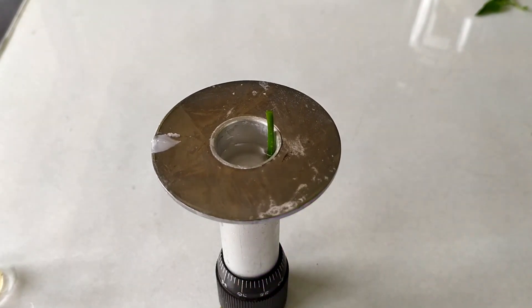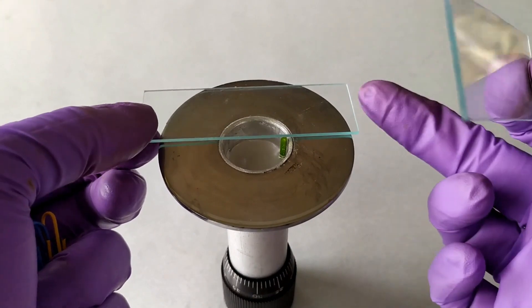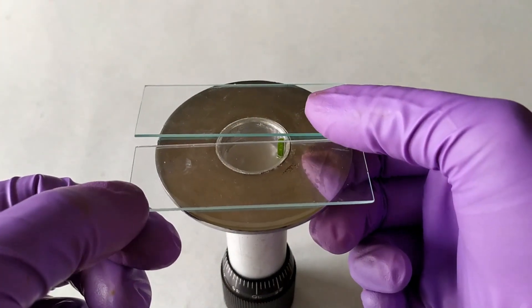Instead of using wax as support, you can also use a shallow piece of pith material such as carrot or potato instead. I have also come across a setup many years ago where someone had fastened two plain microscope slides on both sides of the sample compartment to act as the sectioning platform as you can see here.